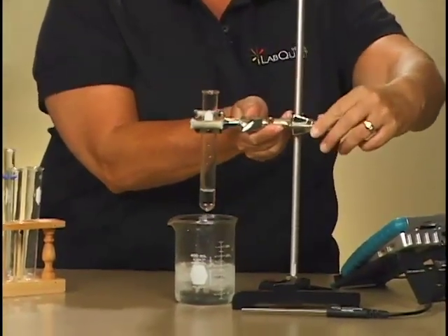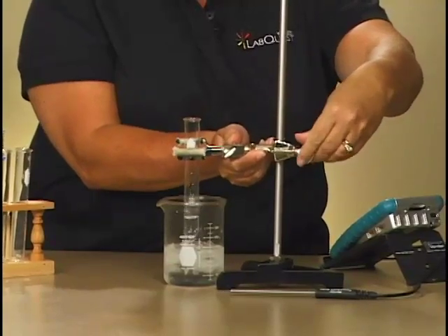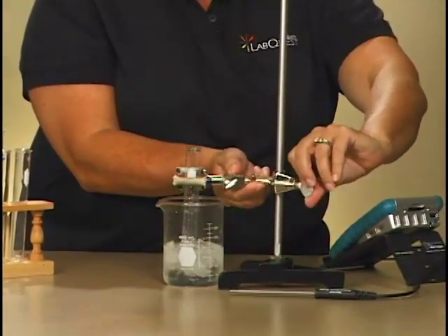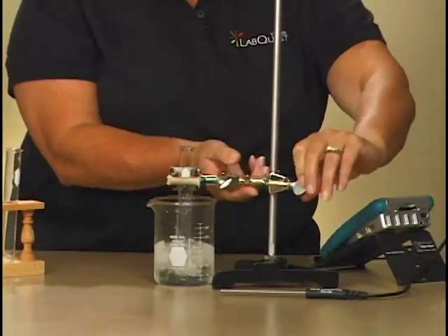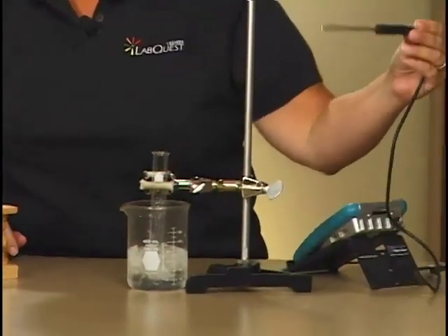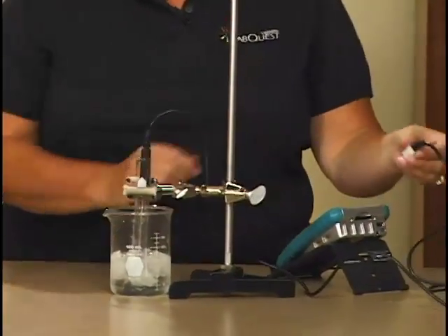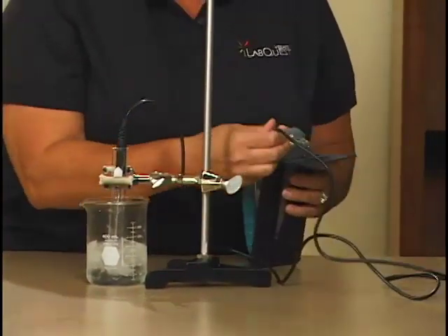Lower the test tube down into the water bath. Place a temperature probe into the test tube, and connect the temperature probe to LabQuest.